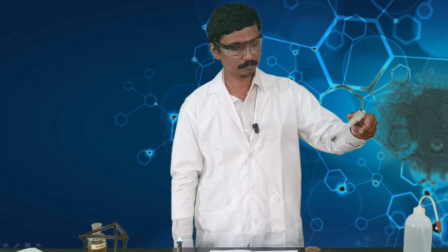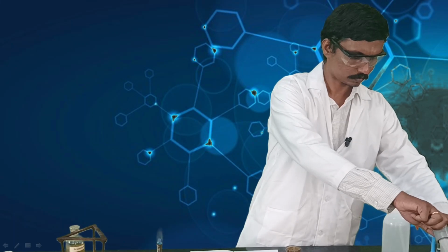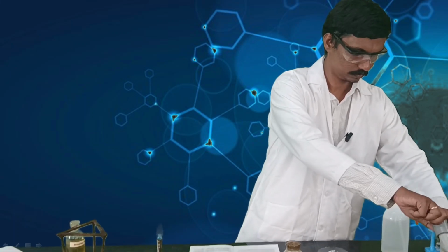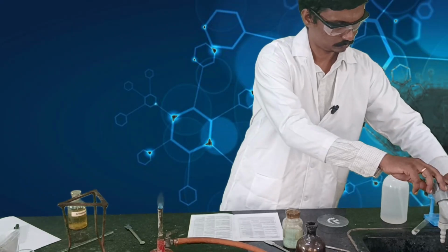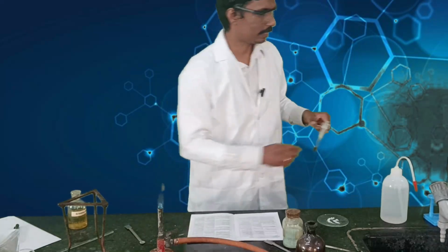Don't immediately keep it under tap water. What will happen is that if this hot test tube is kept under the tap water, a crack can develop and it can also explode and spill on you. So what you do is just wait for some time, and then you can run cold water on top. Once this is done, you then add a few drops of concentrated HCl. So I'm just going to add a few drops of concentrated HCl.